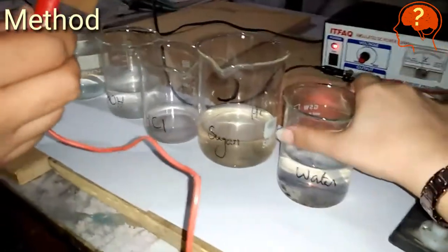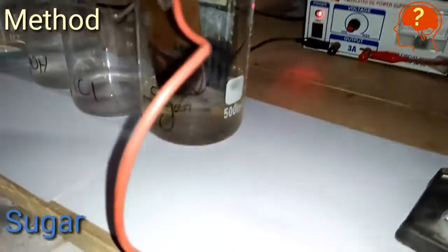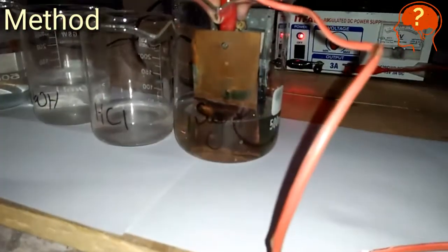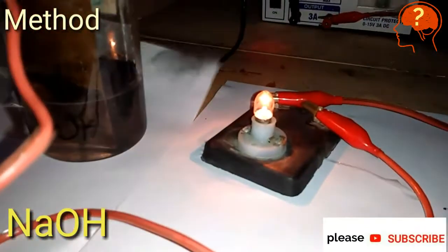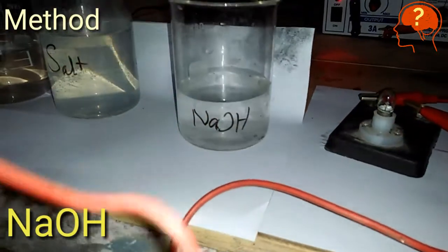There is no glow in the bulb, so water is not a conductor. Now testing sugar — you can see there is no glow in the bulb, so it is also a bad conductor. Now sodium hydroxide — the bulb is glowing, which indicates that sodium hydroxide is a good conductor.